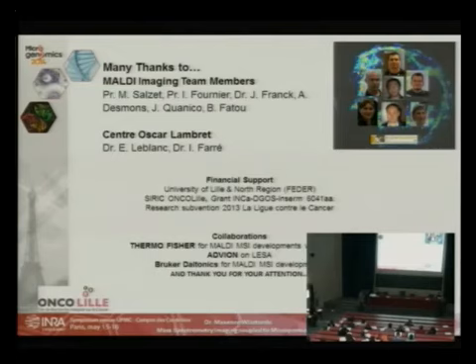It's a non-destructive analysis, because you can also perform classical histology staining after mass spectrometry imaging, and you extract only a few percent of your molecules.